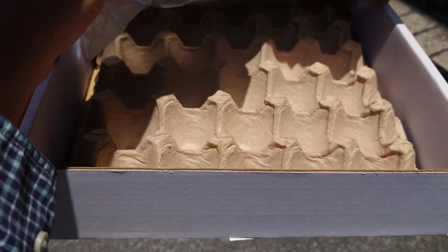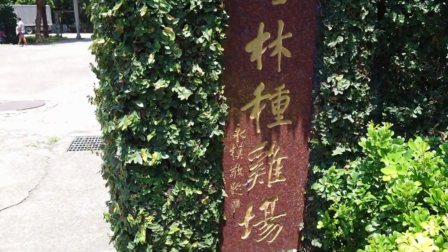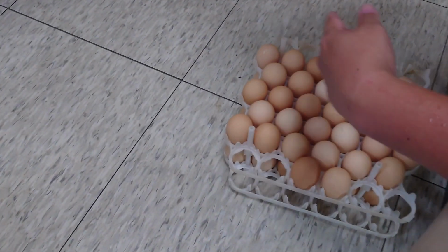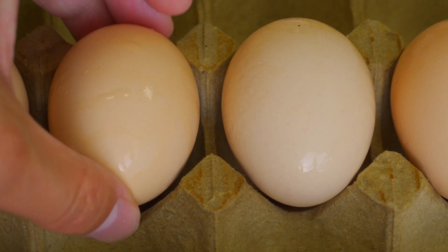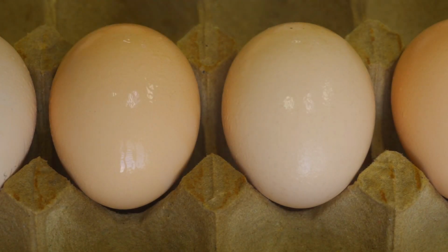Okay, let's get into the practicalities. Where does this whole journey begin? It starts, simply enough, with fertilized chicken eggs. The guide mentions just getting them from a local poultry farm. Okay, keeping it accessible. Then what? Preparing them for incubation? Yeah, some basic but really crucial first steps. You've got to disinfect the shells, usually with ethanol. Standard lab practice. Right. And then mark each egg. Give it an ID, note the date you set it, just good organization.